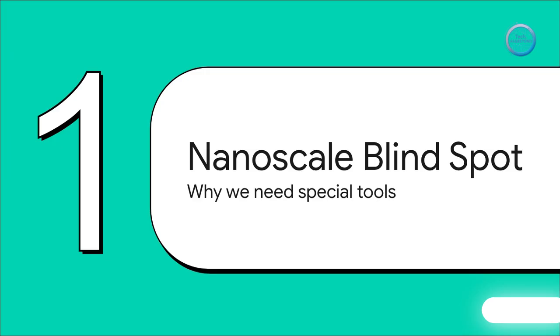The wavelength of the light we can see is between, say, 400 and 700 nanometers. But nanotechnology, by definition, works with structures from 1 to 100 nanometers. So we're often trying to see things that are hundreds of times smaller than our ruler. No amount of fancy lens making can fix that. To see into the nanoscale, we had to throw out the rulebook and stop using visible light altogether.